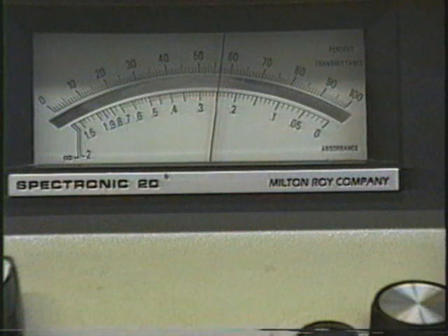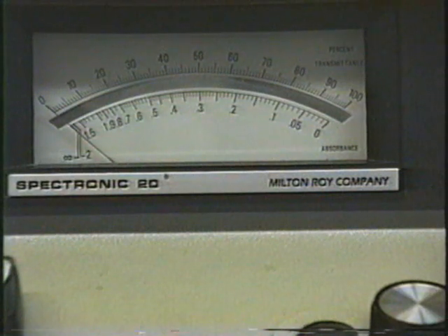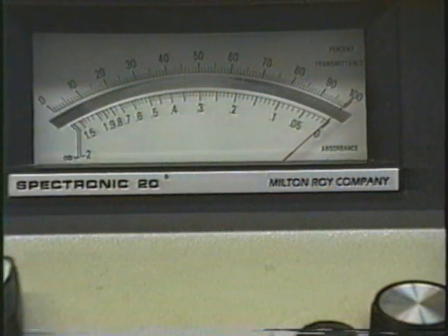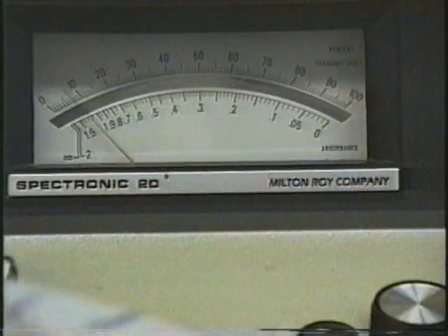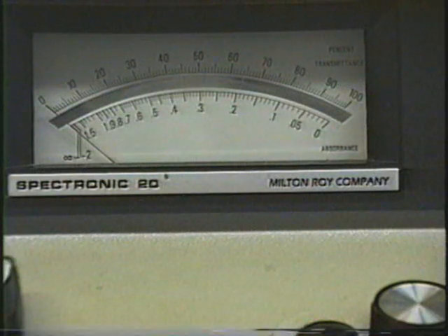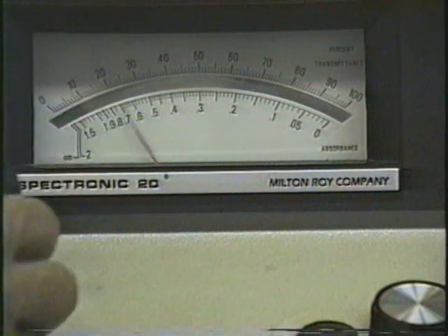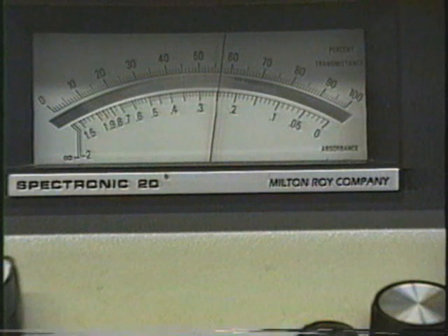There will be a little drifting. That's why you read it twice in a row. Okay. Now, we'll call that 56.8. Now, we could reset this again, make sure it goes to 0, make sure it goes to 100%, tweak it up there just a bit, and put in our sample again. Wipe it off before you put it in, make sure you got all the fingerprints off, line up the trademark, put it in, and we're reading 56.9%. So we've duplicated that reading.